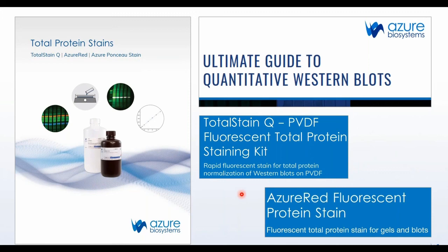If you're interested in the total stains and how they work, you can also check out total stain Q and Azure Red, and look at their own application notes to see how they actually work, and see whether you like it or not.